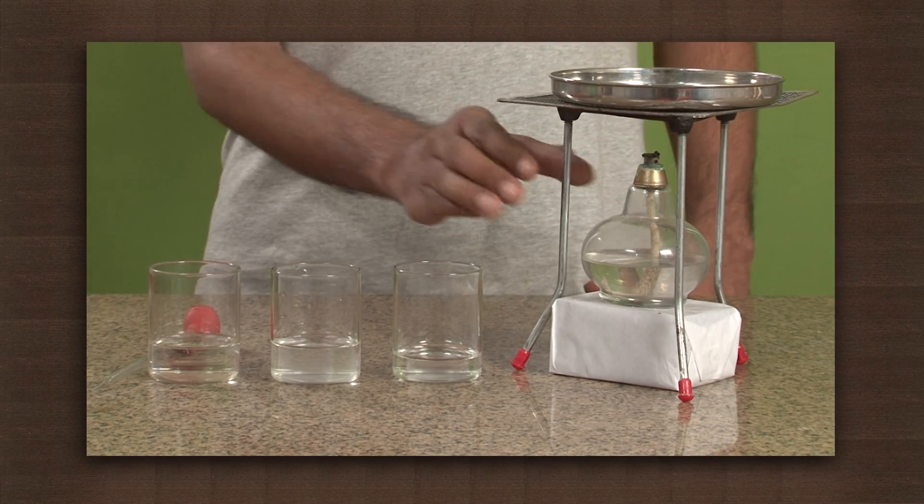Seawater, on the other hand, contains large amounts of the salt sodium chloride. Let us conduct an experiment to test how much dissolved salt is present in different samples of water. We will use three samples of water: hard water, salt water, and tap water.